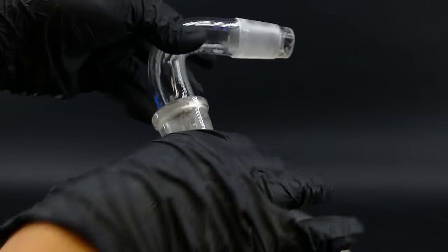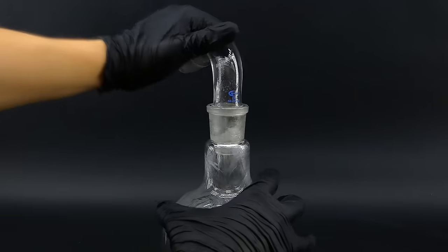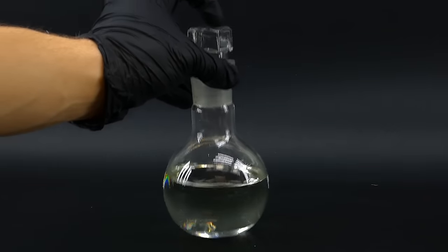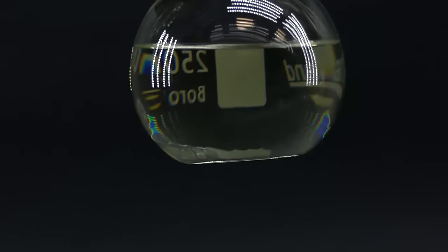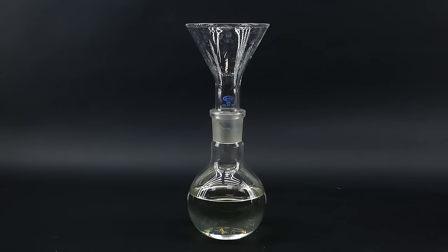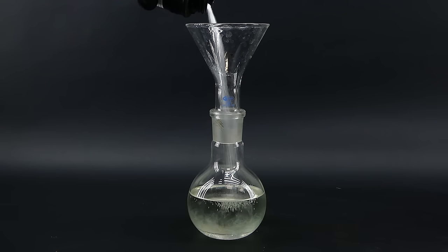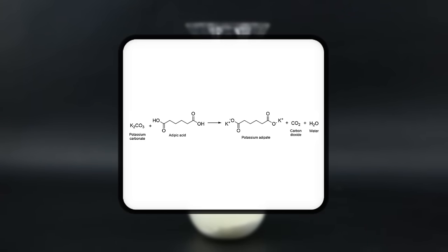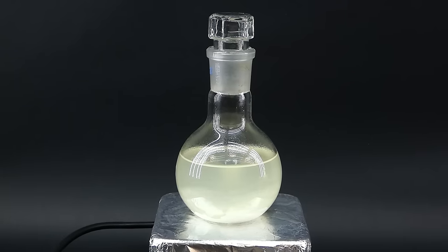It turns out that by not using any grease, the corner piece got stuck to the flask, but fortunately I was able to get it off using a blowtorch. The cyclopentanone obtained through this distillation is really dirty — contaminated with a ton of water and adipic acid along with some yellow junk which I have to remove. As the first cleaning step, I got a lot of anhydrous potassium carbonate into the flask, which will hold on to a great part of the water as well as react with the residual adipic acid to form potassium adipate, which I can then easily remove. After the potassium carbonate addition, some carbon dioxide was produced, indicating that the adipic acid was being destroyed, and to make sure all of it reacts, I got the flask onto my hot plate and left everything to stir for a day.